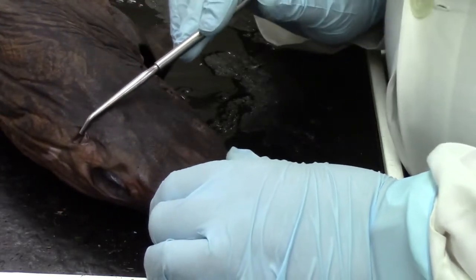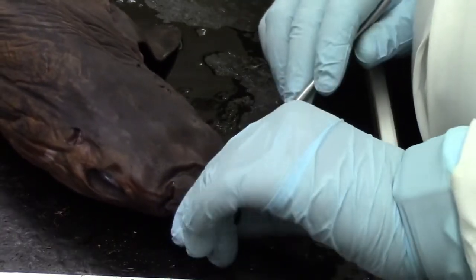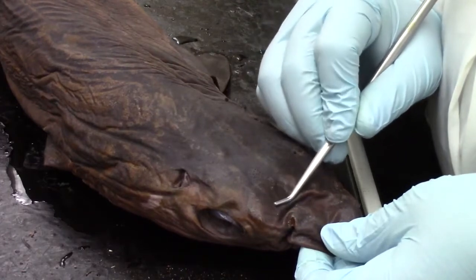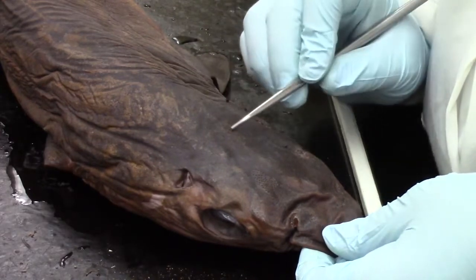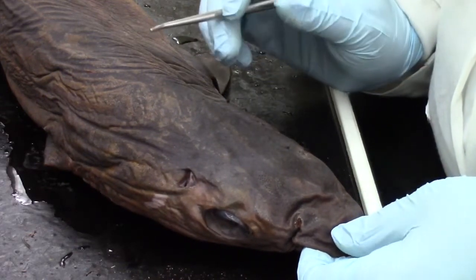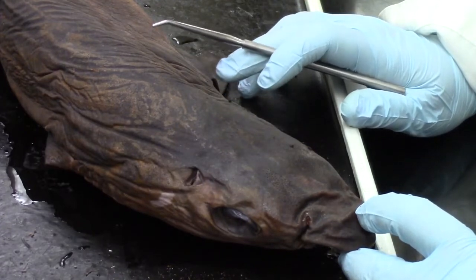And the spiracle is kind of an opening to allow for water to flow over the gills. So water will enter via the spiracle and also via the animal's open mouth. On this view here, I'm not sure if you'll be able to see that on the video, but there's a lot of little pores along the front of the rostrum, and also a pair right here. So this pair of pores here, these are the ampulla of Lorenzini. Those have to do with perceiving electrochemical signals in the water.